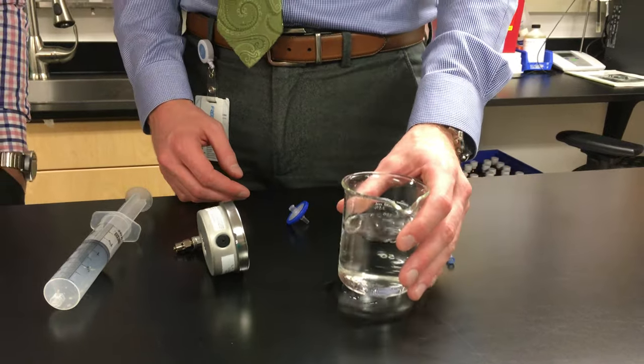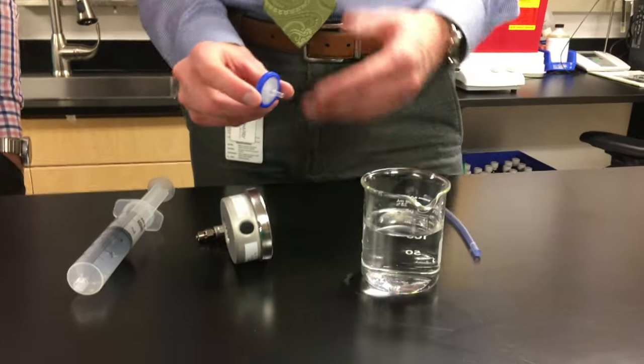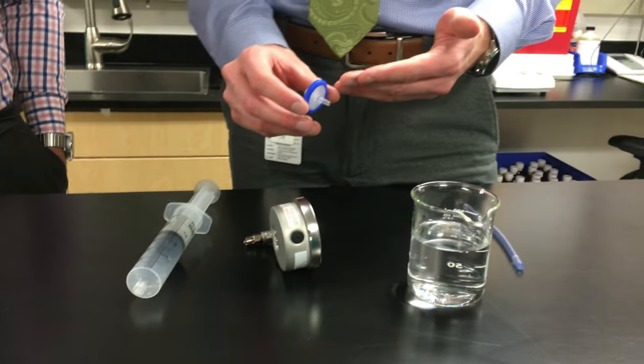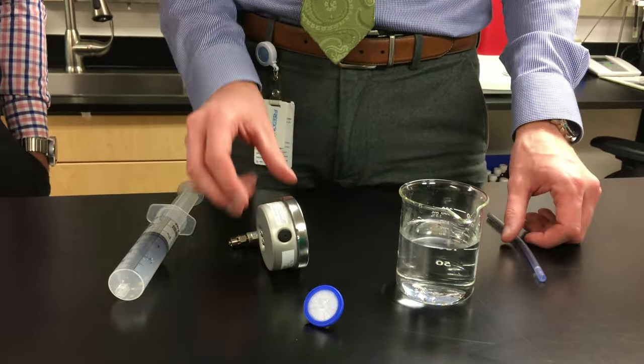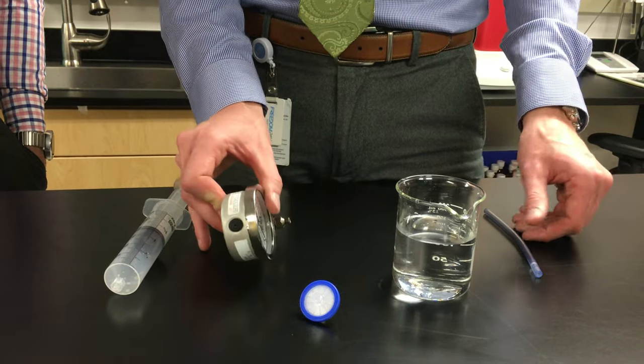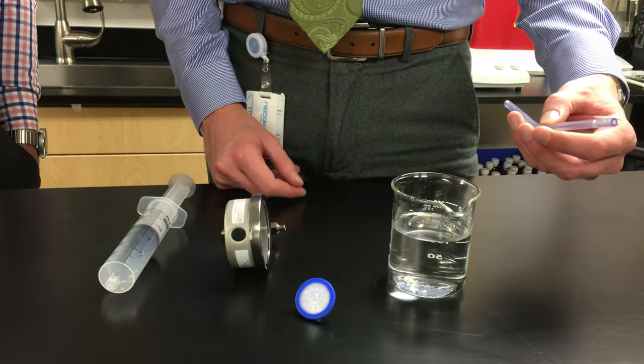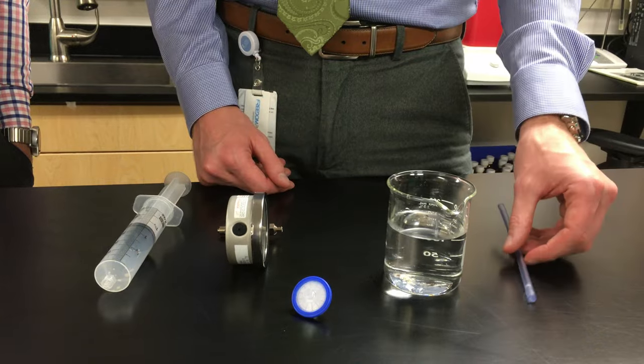We're demonstrating the bubble point test. Here we have some water, and this is a new filter that we'll assume was used for sterilizing. It's a 0.22 micron filter. We have our PSI gauge to measure the bubble point and an end tube to connect into the water.